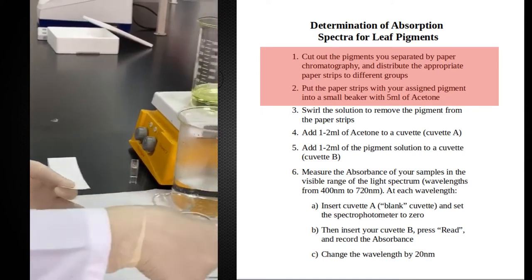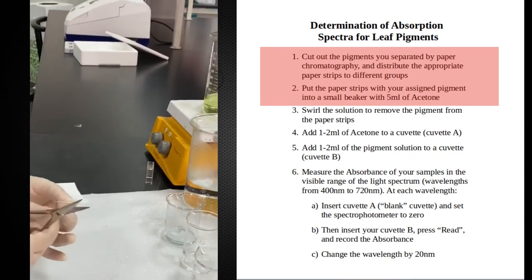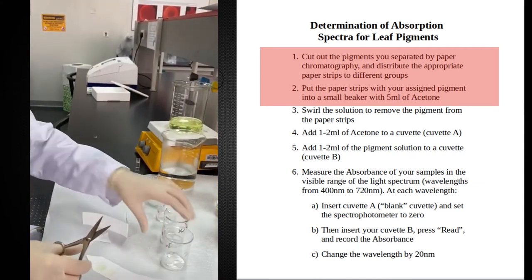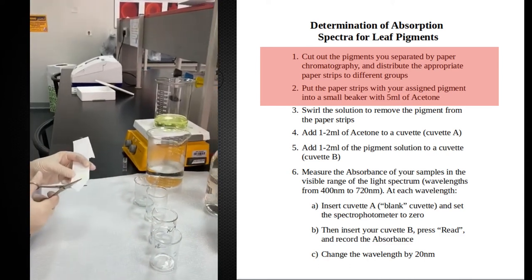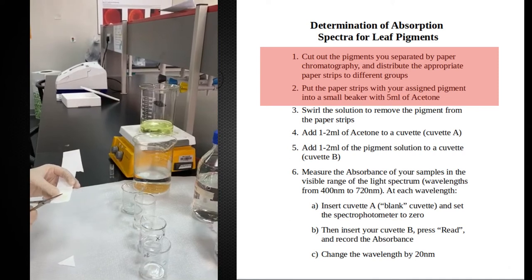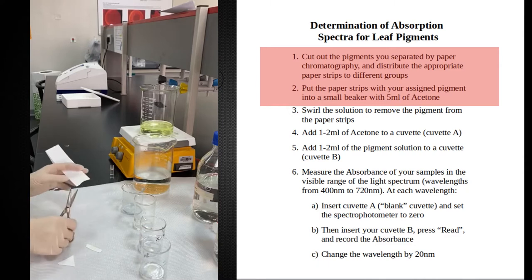So I am re-dissolving those pigments inside the acetone again. And in the next part of this experiment, we are going to measure the absorbance of different wavelengths of light of those pigments.